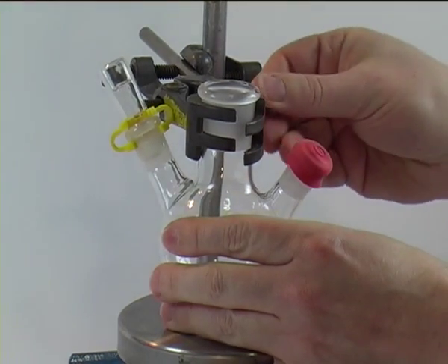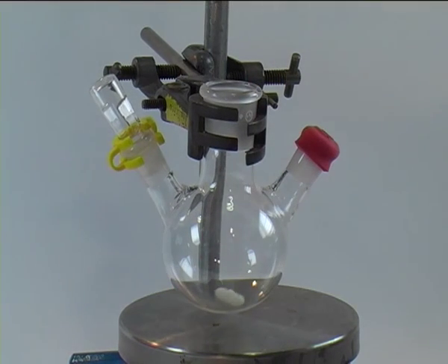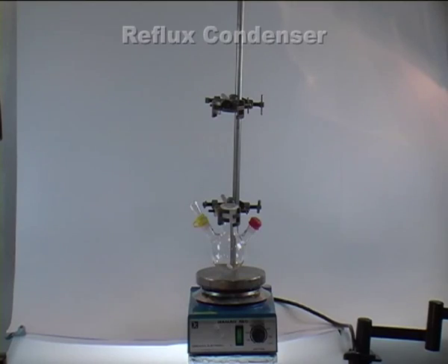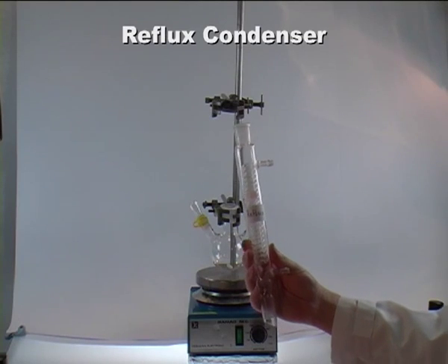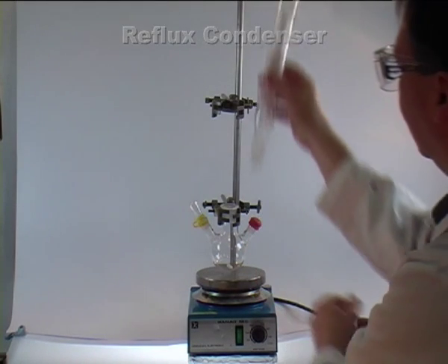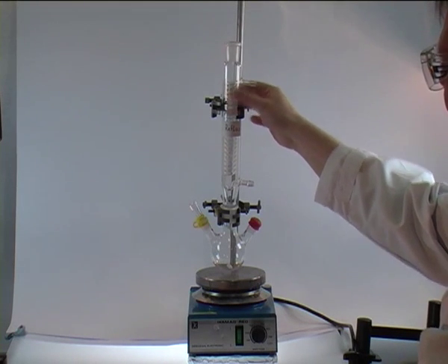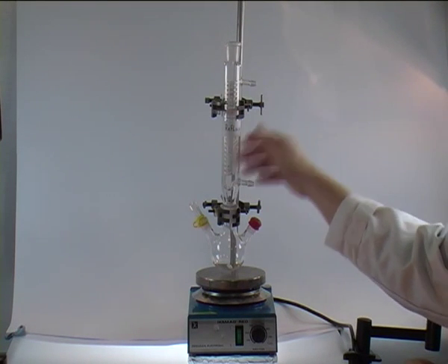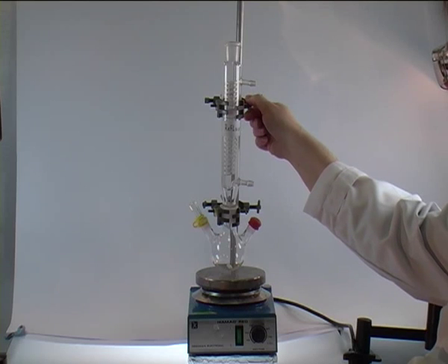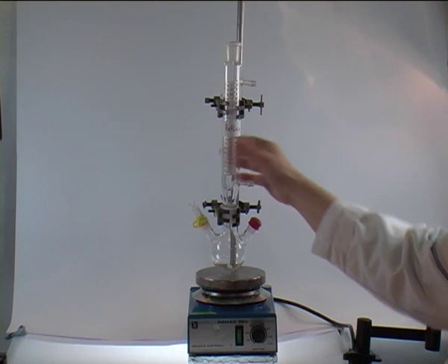Once that is done, we rotate the round bottom flask into position. The next piece of equipment is our reflux condenser, which can be put on easily if the whole arrangement was aligned vertically. And what remains is just to tighten the clamp so it sits securely.